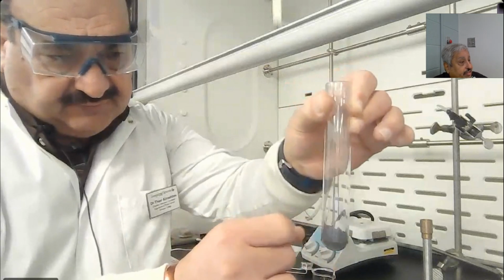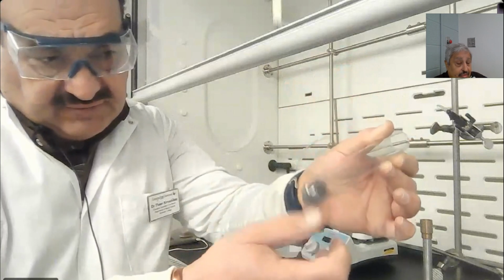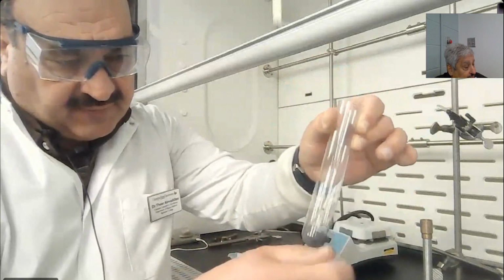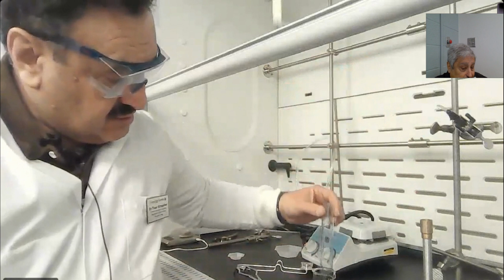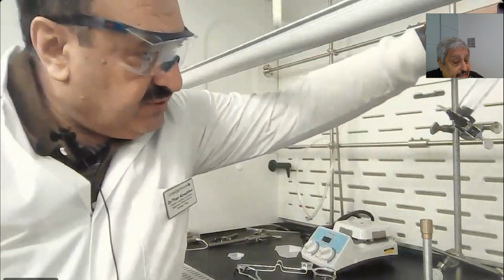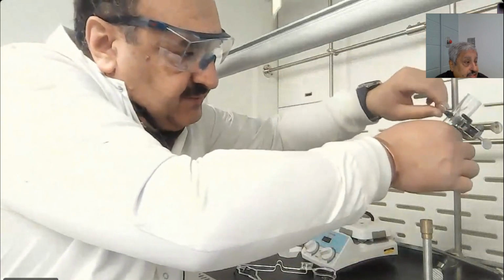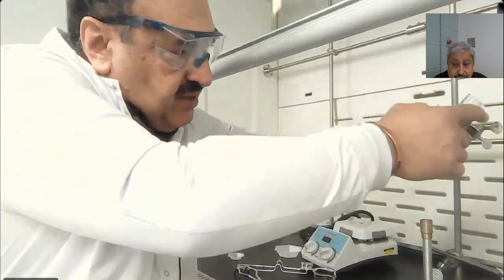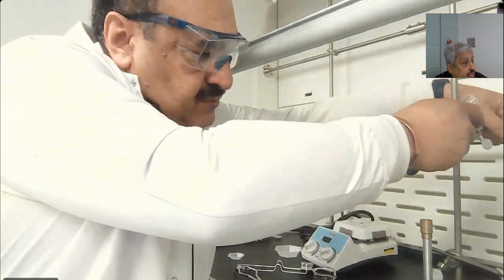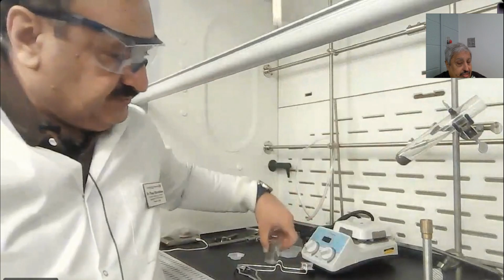He wants to show me, but that will give an error. Because we heated the whole thing at the very beginning to clean up and get all the fingerprinting out. Now if you tap it with the finger, then there's a problem. You get all the fingerprinting back again. But I think all in all excellent. All in all excellent, except the few issues of adding the Bunsen burner and the impurities.